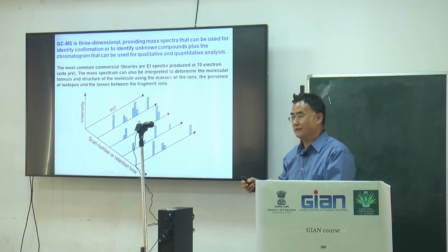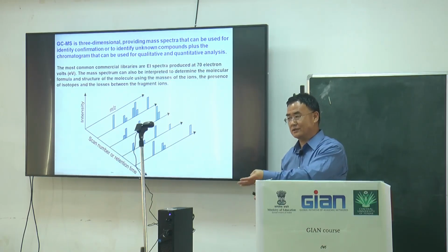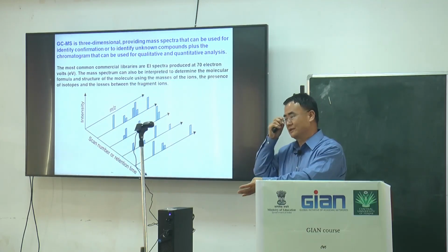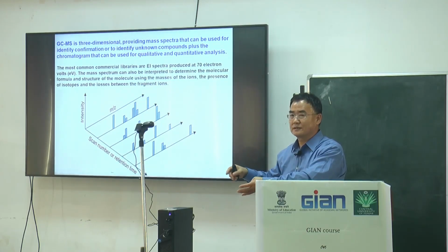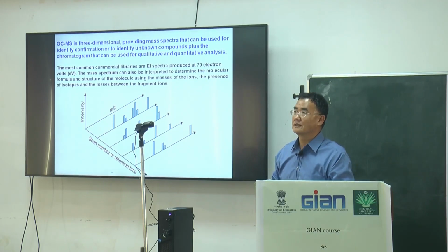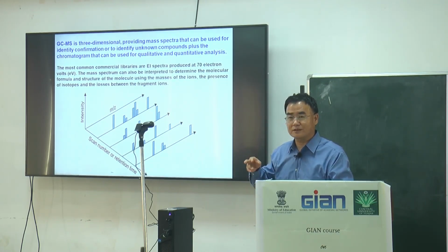We do the same way with the extraction and also use the methanol and sodium. Sometimes we use potassium, the sodium hydroxy or hydroxy potassium mixed together. We also call it saponification, right?